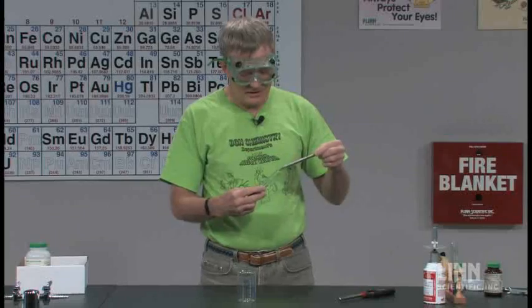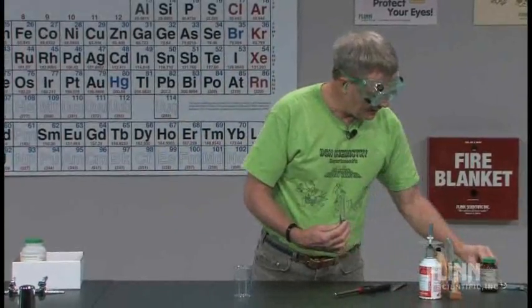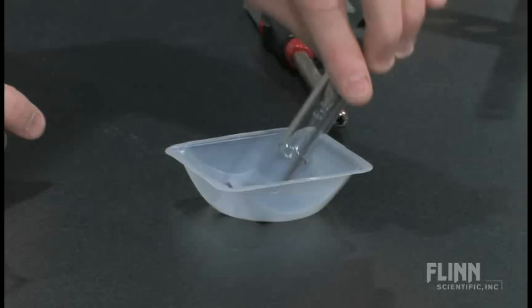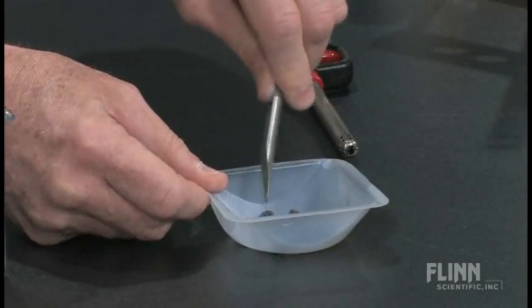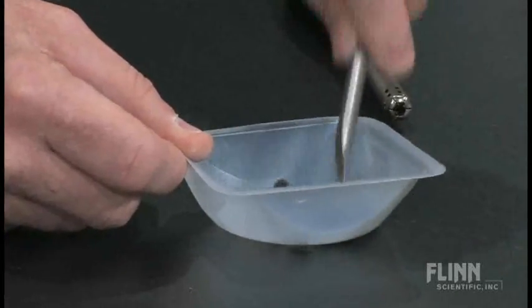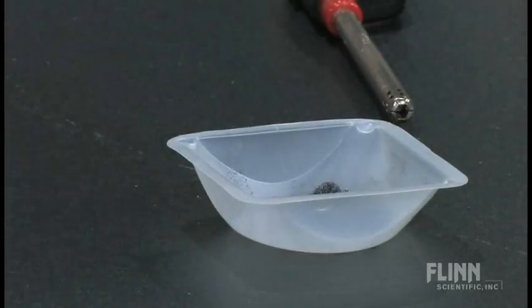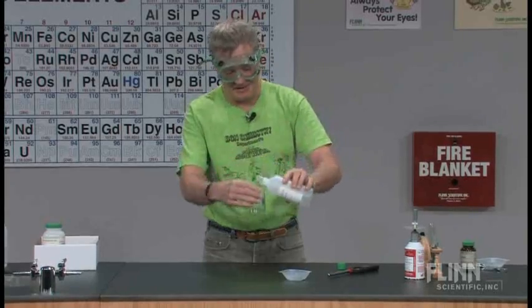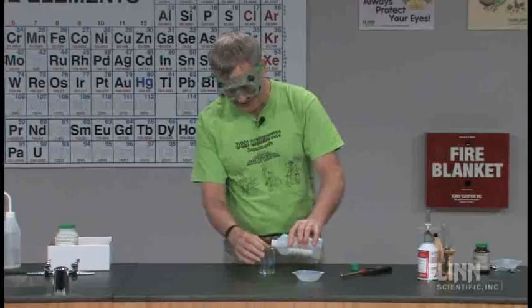I tried taking some, and I got a little in here, I think. I'm going to pour that product out into this dish, just like Julia does. There it is. Isn't that wonderful? Oh, this is going to be good. I'll mash it up a little bit. It's kind of lumpy, but it should be all right. And I'm going to dump some 3 molar hydrochloric acid in here. And maybe a pipette too. Hey, this is just like in my classroom. I don't own a bottle that doesn't have a pipette inside it.